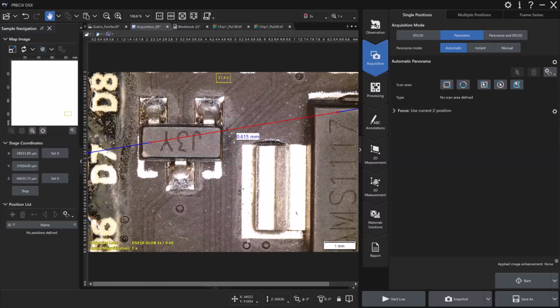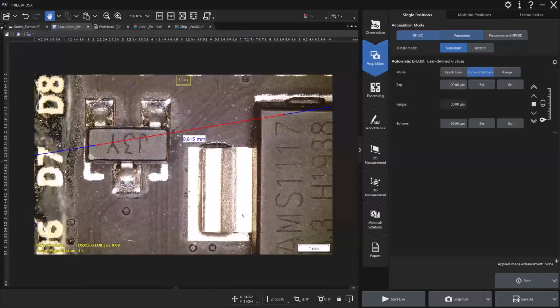Yeah, for those of you who aren't familiar with the stitching Rob's talking about, that's just the ability to take a small field of view and add them all together. Just like you said, stitch them across. So the microscope moves, takes a picture, moves, takes a picture, and then puts it all together in one big picture. So even though you have a small field of view, you can capture the entire moving range of the microscope, right? That's correct.